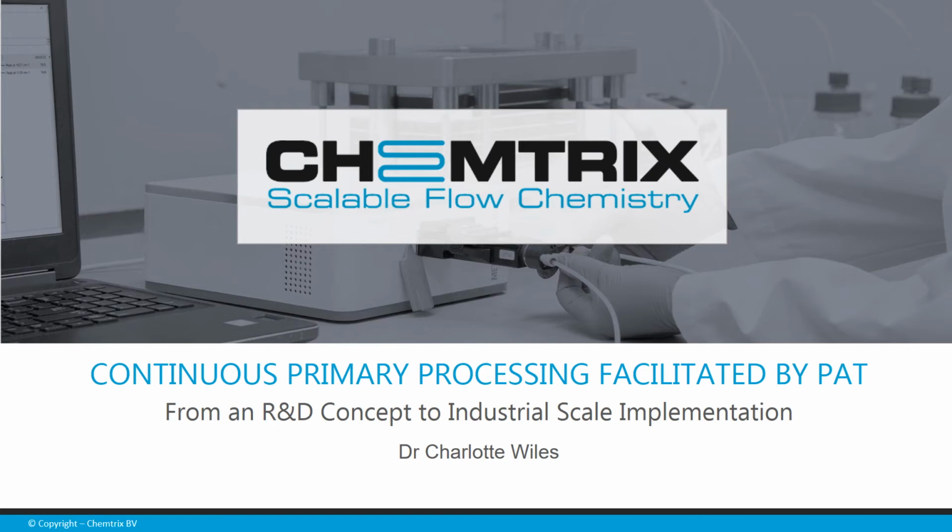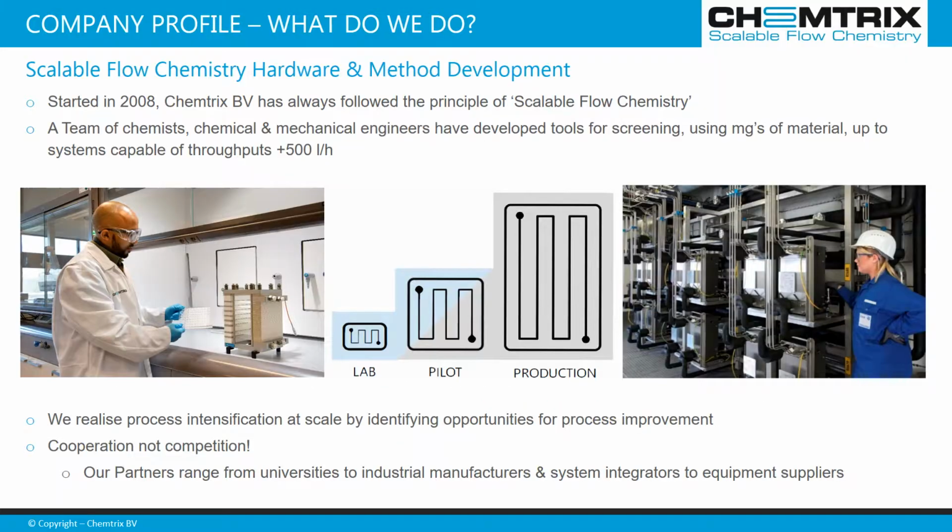Today I'm going to talk to you about the use of process analytical tools in the development of continuous flow processes. This is going to cover from an R&D concept through to industrial scale implementation, using case studies that will highlight the type of development work that you do at each stage.